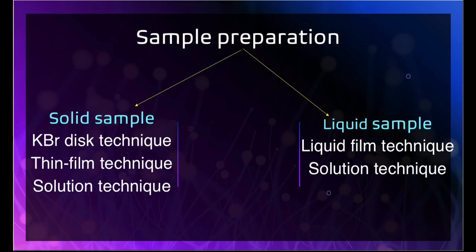Sample preparation. For solid samples: one, KBr disc technique; two, thin film technique; three, solution technique. Liquid samples: one, liquid film technique; two, solution technique.